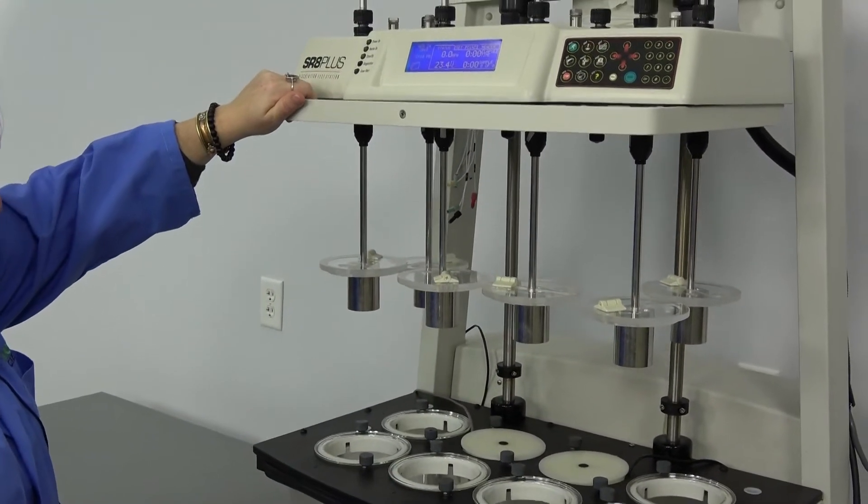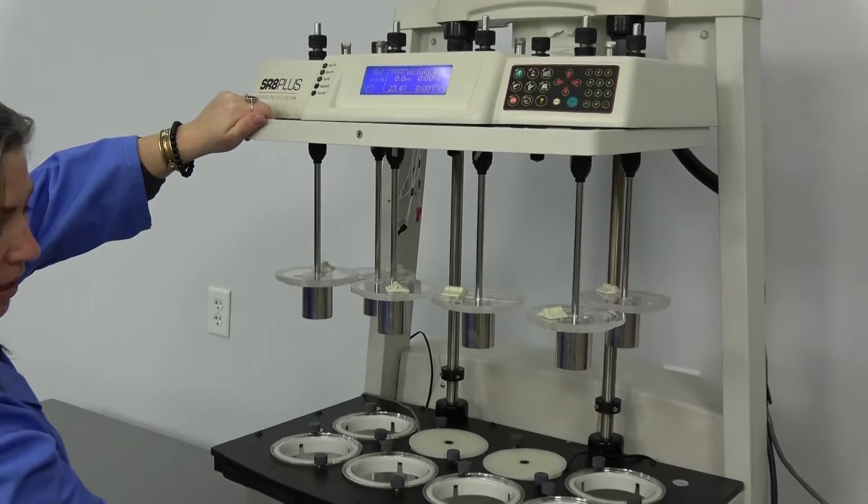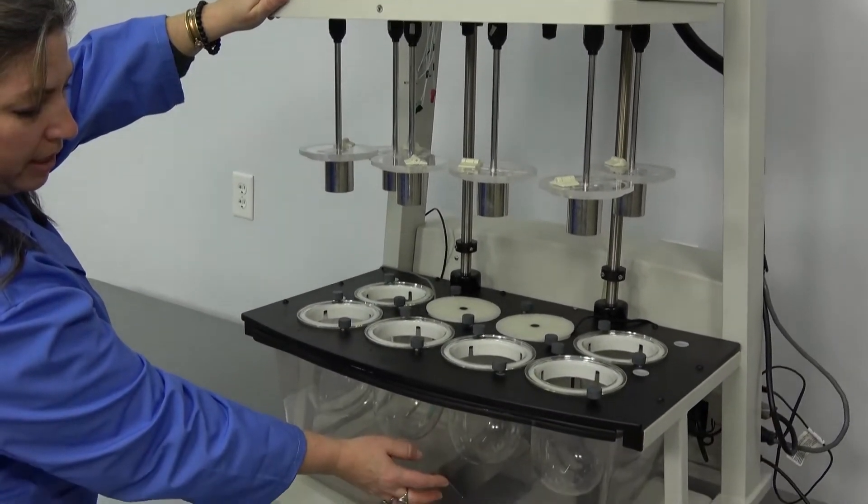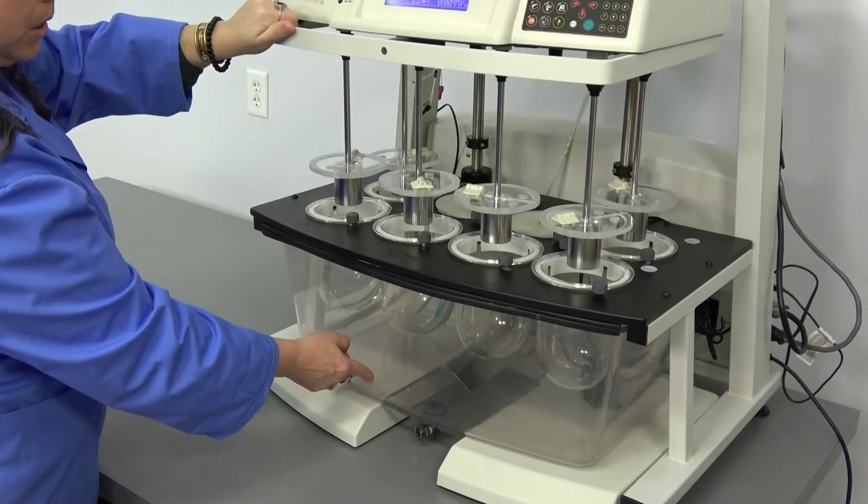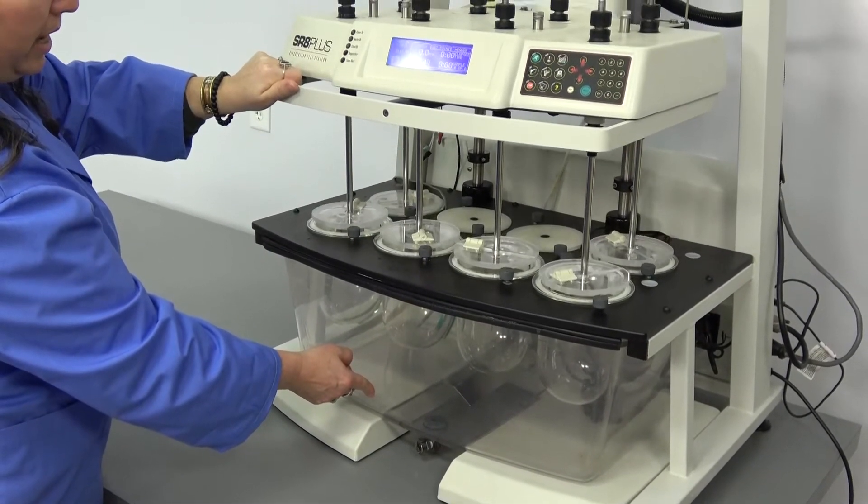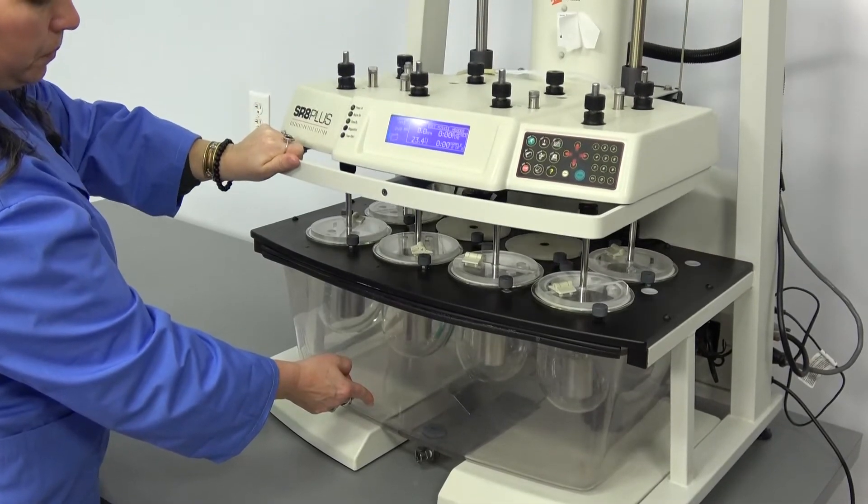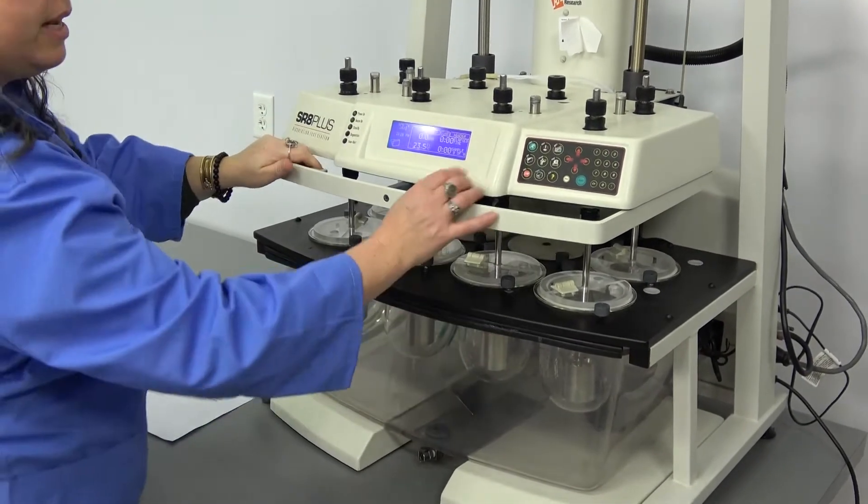So to get this covered, down here is where the water goes in. This water bath can be controlled to be heated. You can lower this down. It is functional.